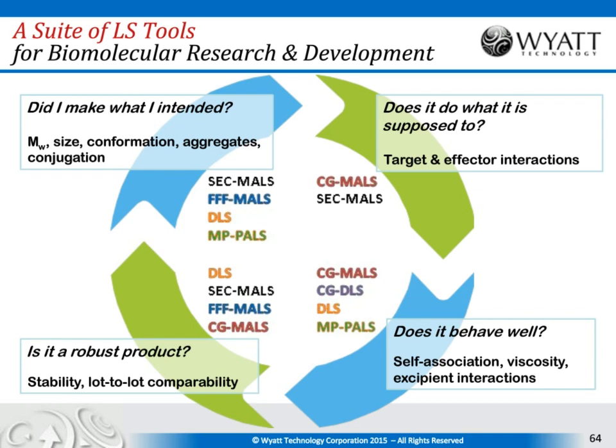You can look at the polydispersity of the peak, and you can look at the average position, and you can clearly see shifts in the average position on the order of a couple of percent, say 1 or 2%. So that's the addition of just a few percent of small aggregates. Again, the polydispersity also is quite sensitive to that, and you can see a change by a few percent. And these are robust, so you can make these measurements repeatedly.